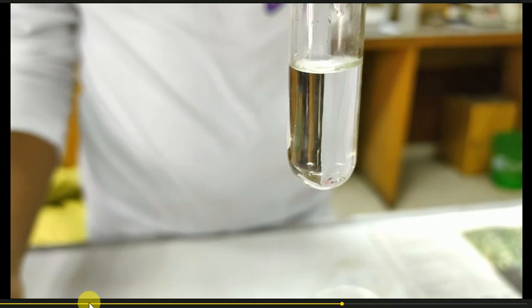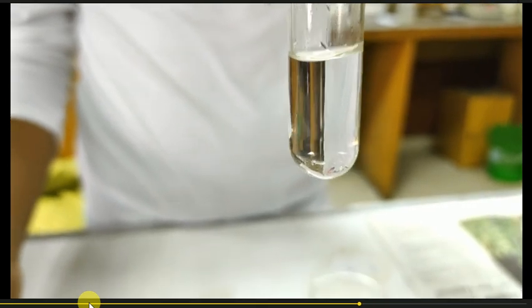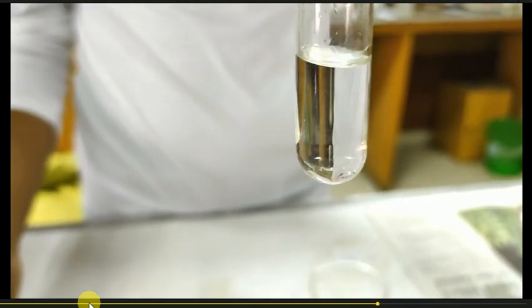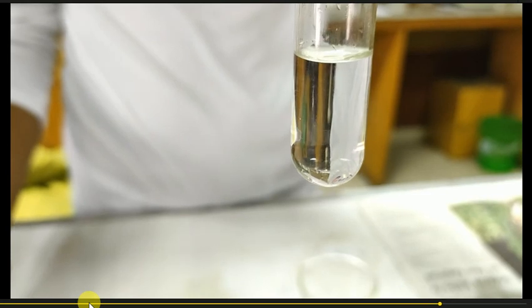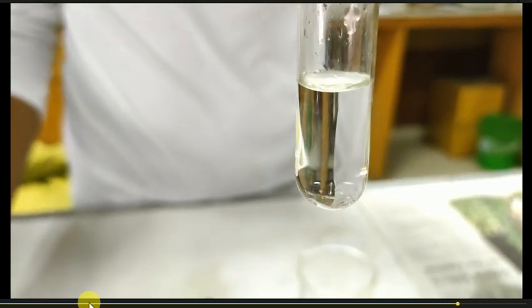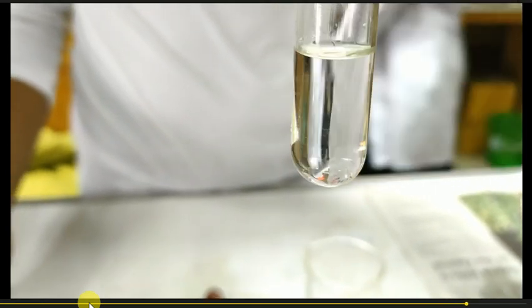Remember that the precipitate didn't dissolve in case of aluminum when ammonium hydroxide was added, but in case of zinc ion, the precipitate which appears due to the presence of zinc ion with ammonium hydroxide dissolves when excess ammonia is added.